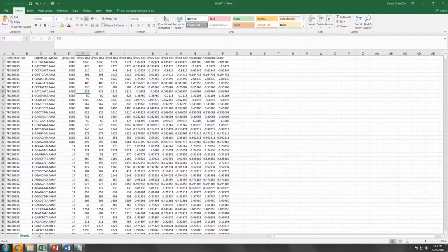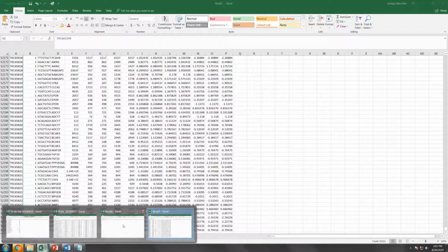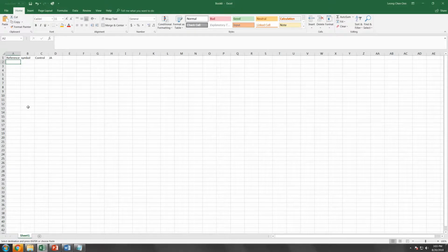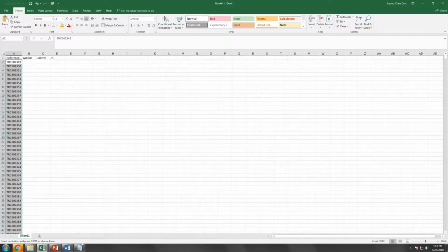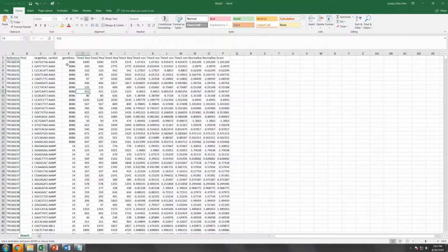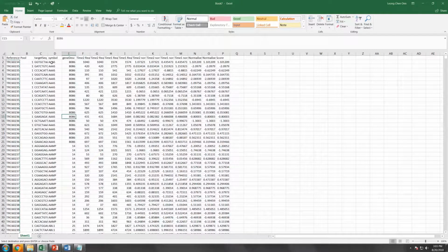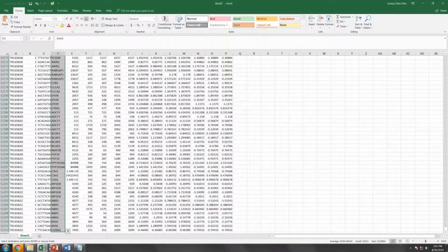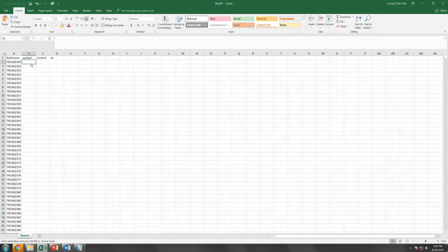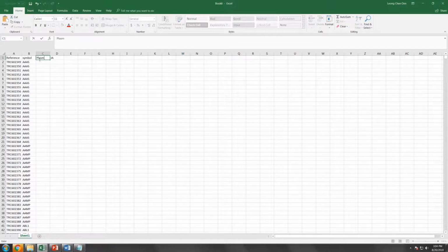as the input file for the RIGER. Before we do that, we are going to copy, for example, this is from BXPC3. So we are going to create the input file here, with reference. I'm just going to use the TRC number. And then for the gene, what is the next column? The next one is symbol. So I'm going to copy the gene symbol and put it here. And after that, I'm going to create this. This will be plasmid, which is the control, and also sample.